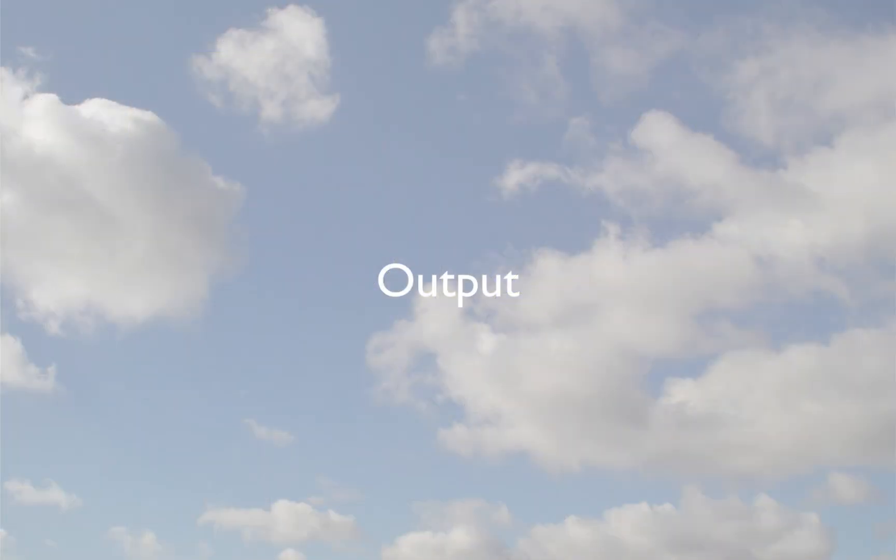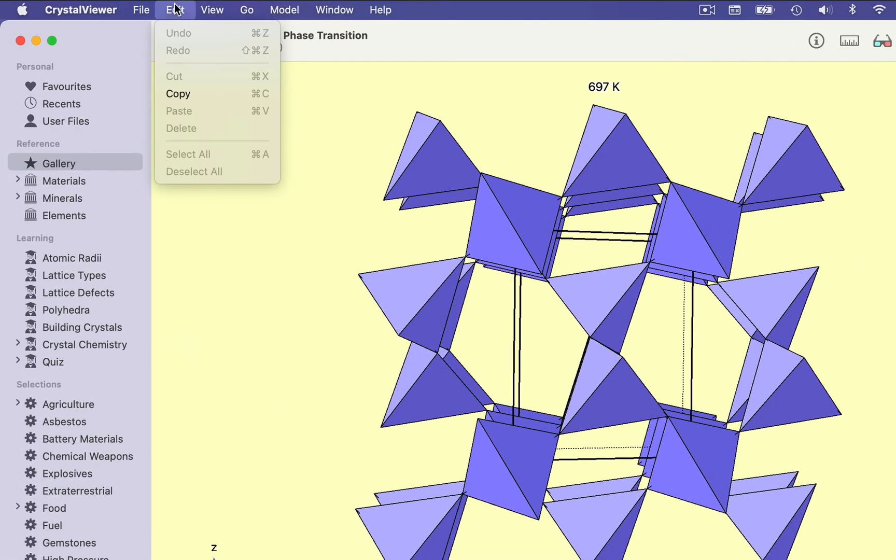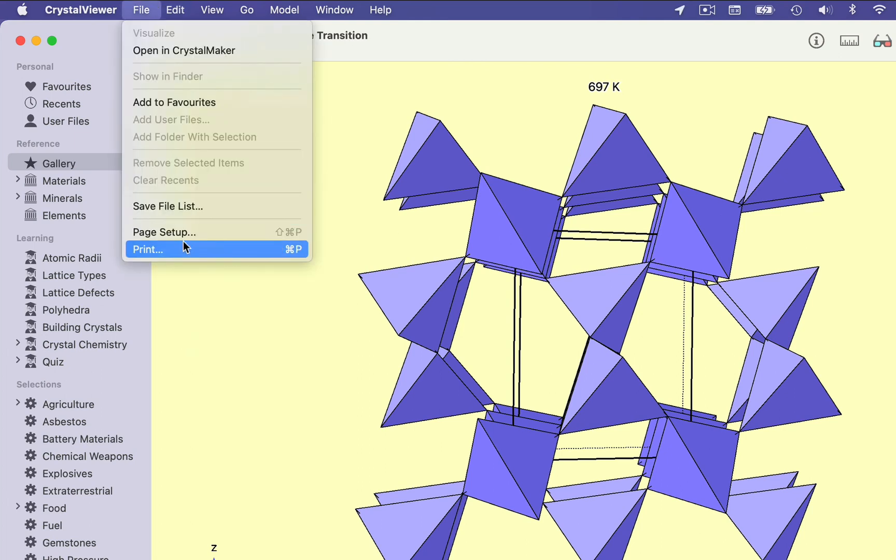Now we can use the output menu to share content. Here's our output menu button and I can share the three-dimensional structure with Crystal Maker, with Crystal Diffract for X-ray or neutron powder diffraction simulations or Single Crystal for any kind of single crystal diffraction simulation especially good for electron microscope diffraction simulation. We could also share images, the current screen image, with mail, messages, photos or we could even share it with another program or computer using AirDrop. So all of these options are available to Mac users. We could also copy or print using this menu. Windows users can get to those commands using the edit copy command or the file print command.